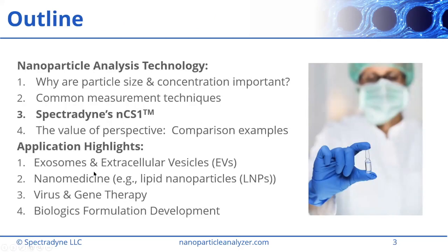So in the first part of the talk, we will review why particle size and concentration are important metrics, and review a few of the most common measurement techniques, similar to what Mr. Hiroyuki-san did earlier. I will give some detail about how Spectradyne's technology specifically works to accomplish the particle analysis that it does.